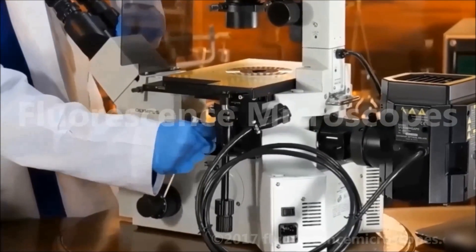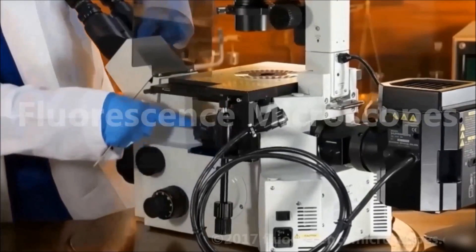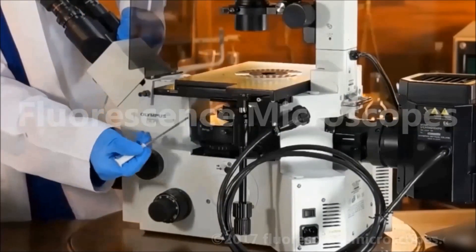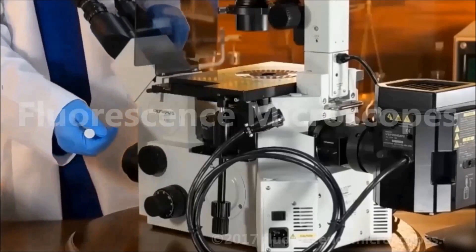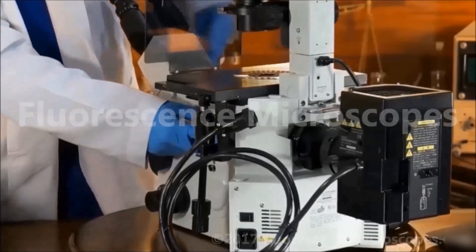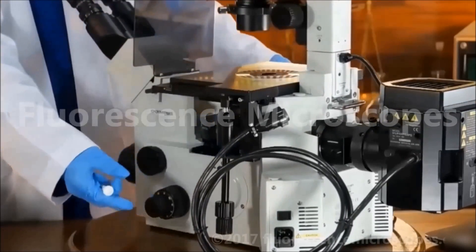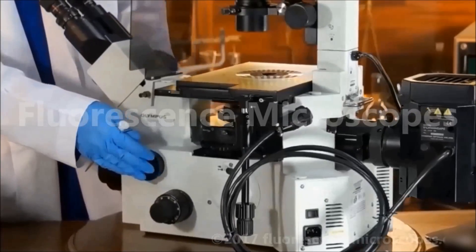This is a shutter. You normally want to keep the shutter closed, which would be this position, blocking all light from the back. Be careful about the UV light. It is harmful. If you're taking this out, and you've got direct light coming in, that's not good. You need to wear safety glasses.